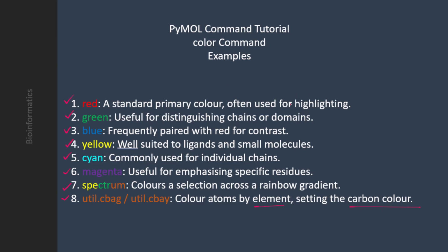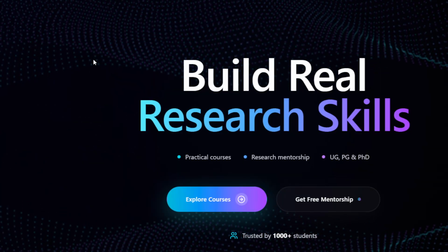Okay, now let's go to PyMOL and then apply these commands and see what kind of output we are going to get. Before that, let me show you the resource that I've created, and I show that all the time in my videos. This is the website that I've created.